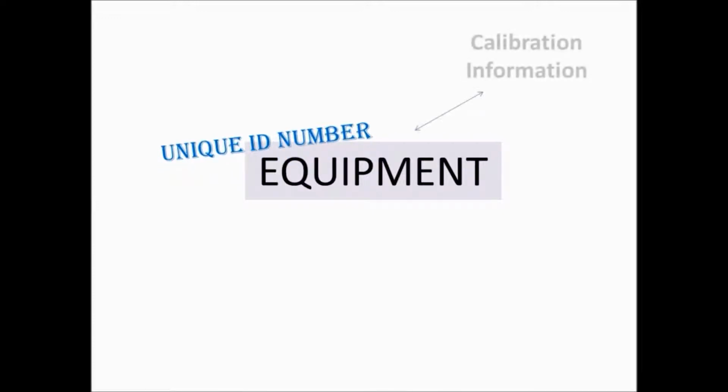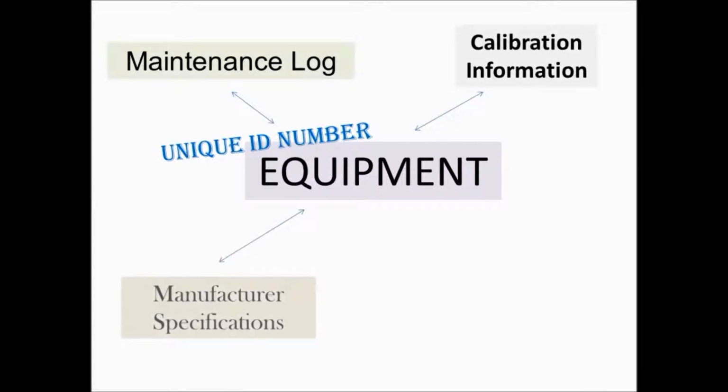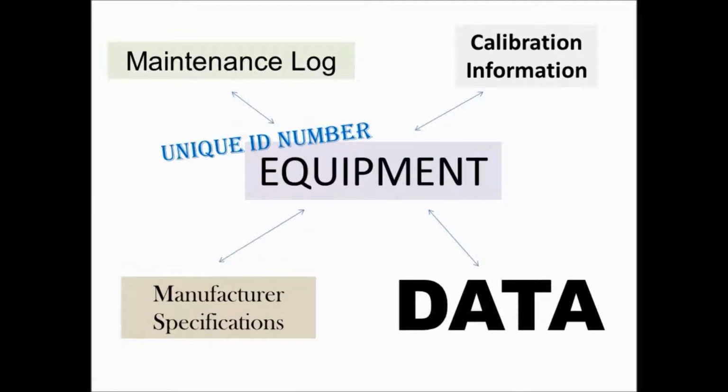By using a unique number for each piece of equipment, reagent, or standard, you can link all of your calibration information, maintenance log information, and manufacturer specifications with your data.